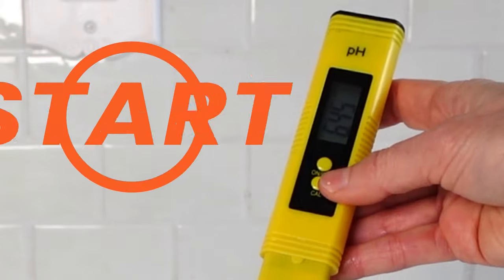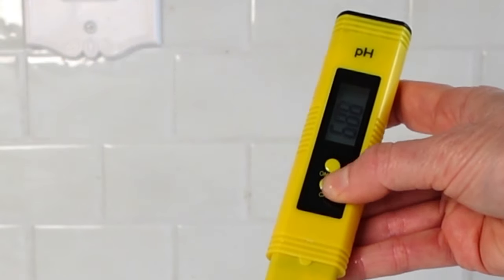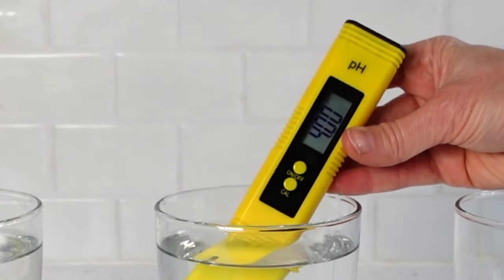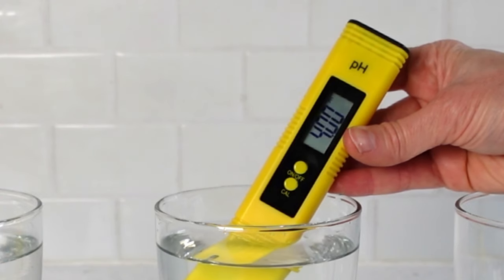Place the meter in the water. Hold the calibration button for five seconds, release, then one quick press. Wait for the meter to start and stop flashing. Calibration number two is now complete.